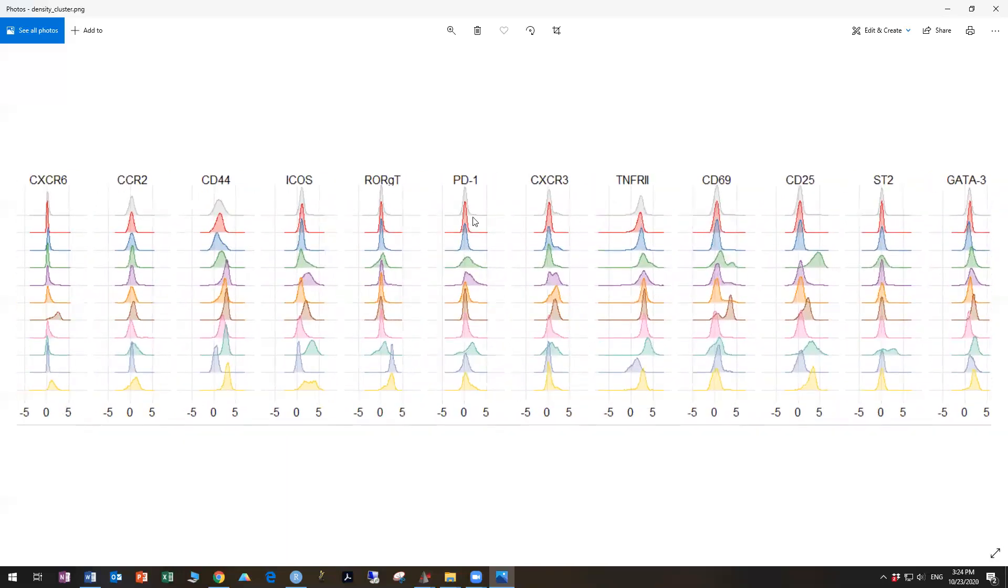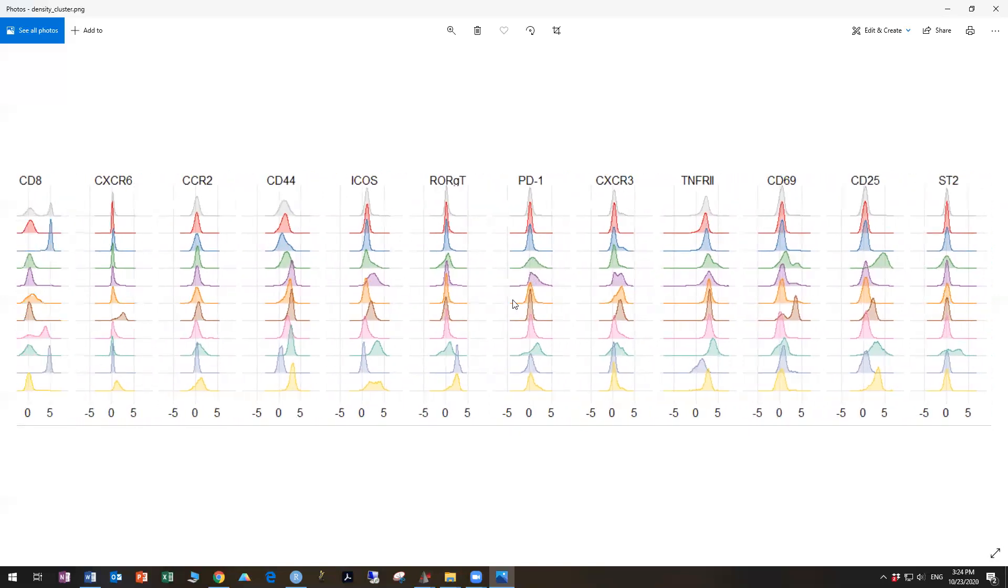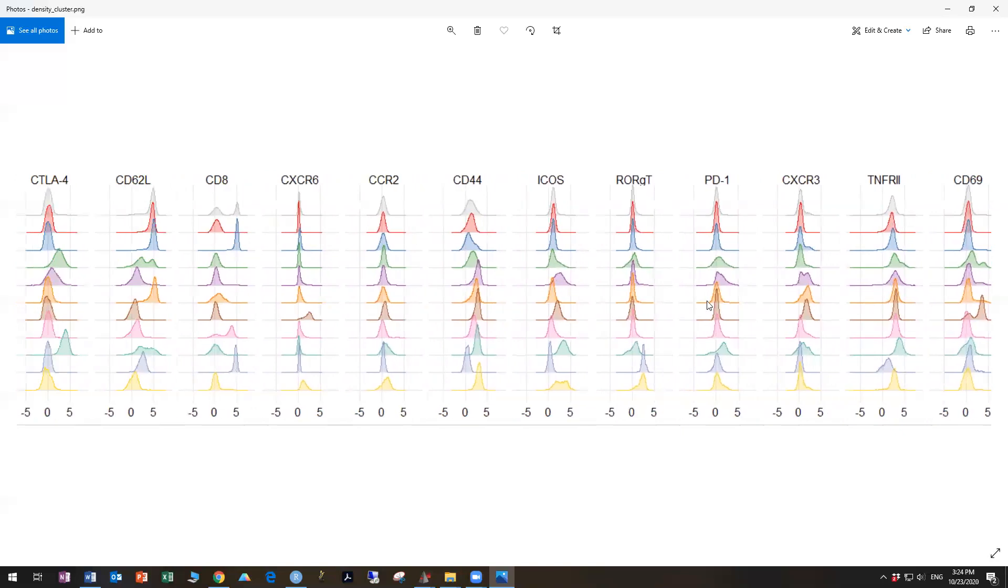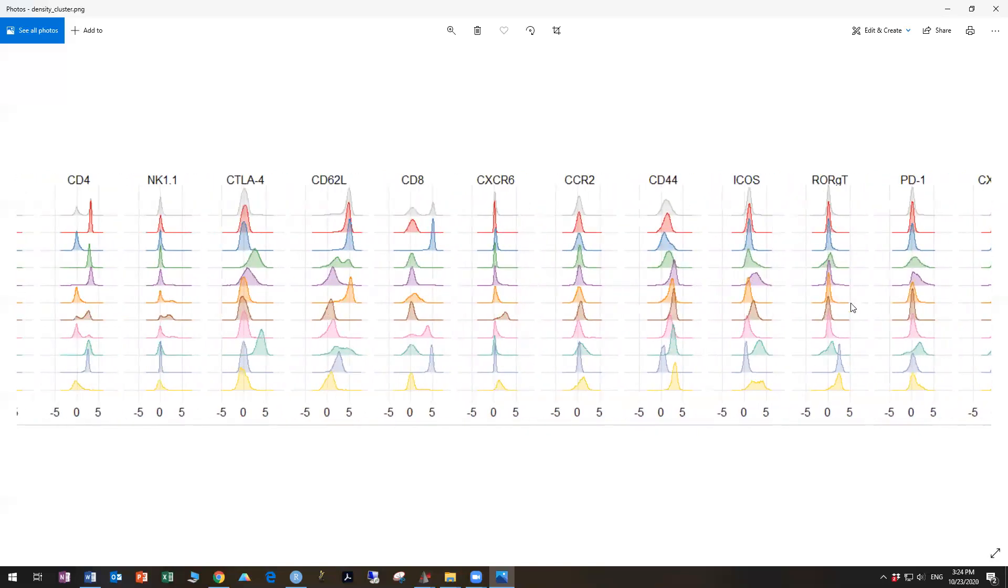Like say PD1 here, because a lot of the cells are sort of intermediate, it may never separate on that. That's just the biology.